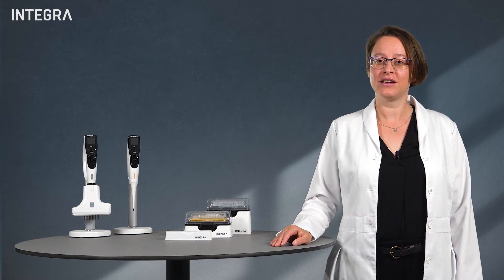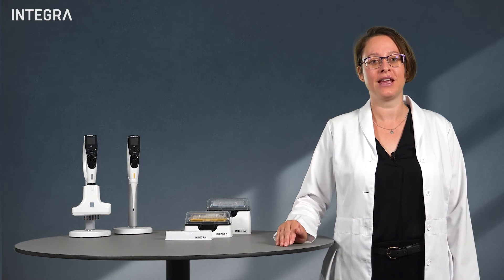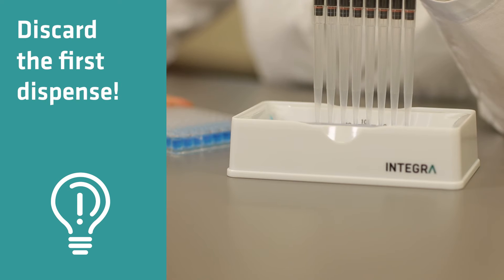When the electronic pipette is finished aspirating the liquid and you want to repeat dispense, the mechanics inside the pipette need to change direction from aspiration to dispense. This could result in the first dispense being too low in volume. To eliminate this effect, it's recommended to discard the first dispense, often back into the source vessel. This is typically 3-5% of the pipette's full volume and is sometimes called the pre-dispense.